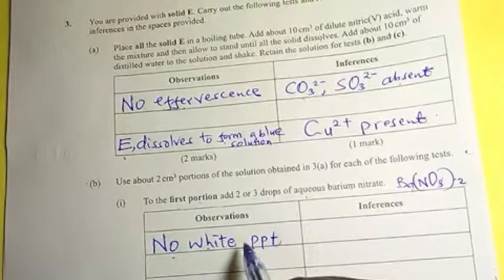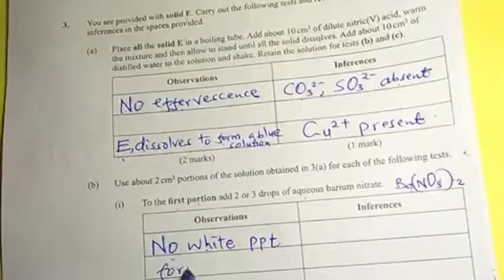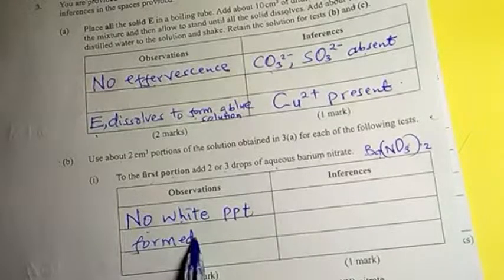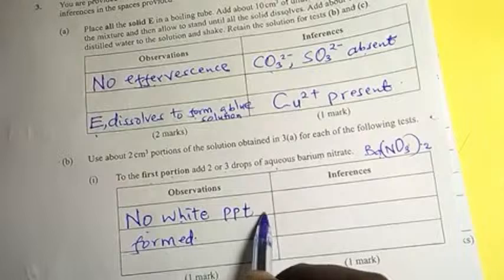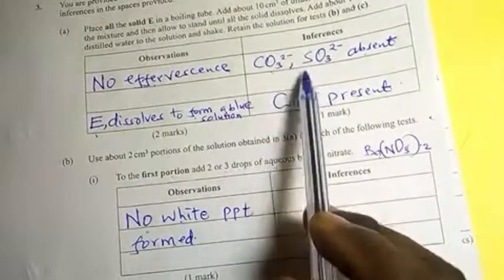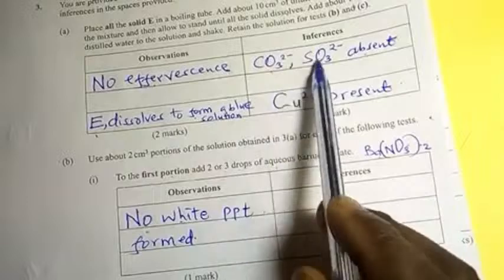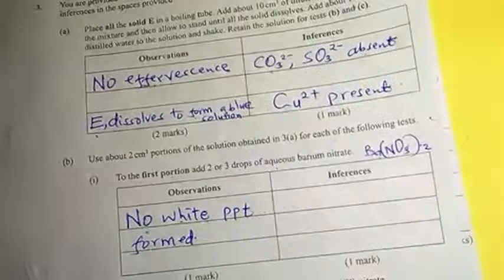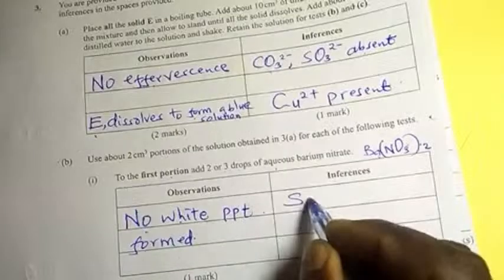No white PPT formed. Then it means there was no carbonate, there was no sulfite. Of course, we have said that these ones were absent. So here now, what we are remained with, we are going to say that there is no sulfate.